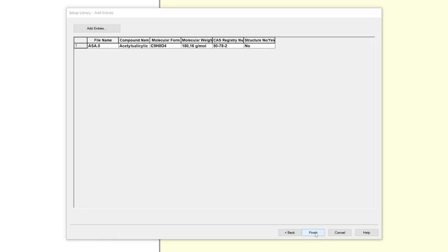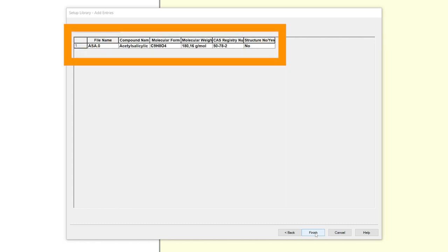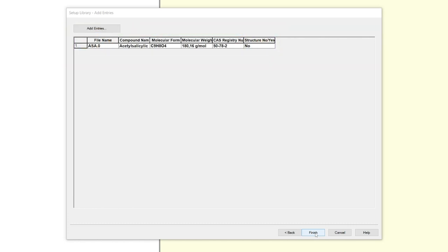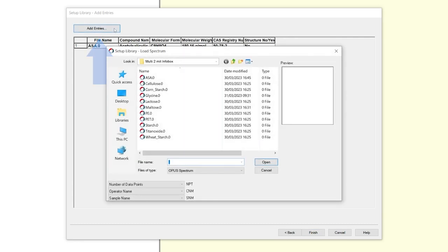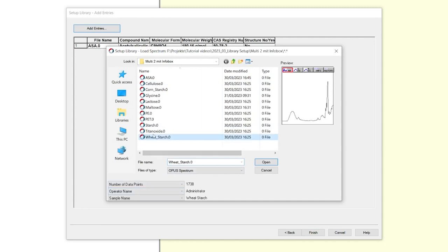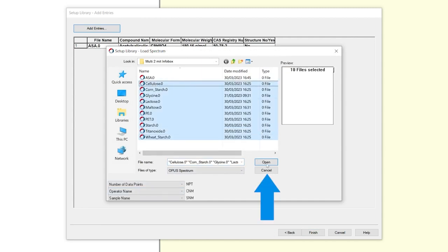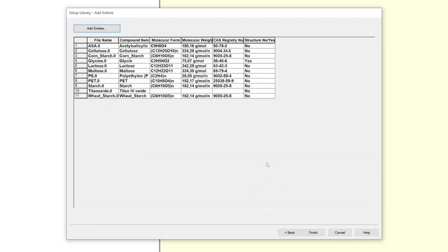In this step you add your entries for your library. If you selected your spectral ranges with a master spectrum, this is already shown in the table. Otherwise it's empty. Click add entries, select your spectra you want to add to your library, and press open. You can delete an imported spectrum by selecting the corresponding number with a left click and pressing delete.